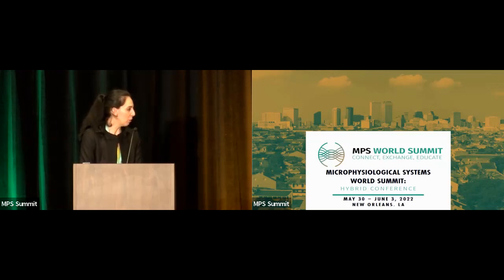And that will create some questions that we need to address in terms of compatibility with the media, and also at which stage we need to connect the chips. The stage of maturation will also play a critical role there. So they can be connected, but we need to address all these challenges in terms of timing and connectivity in terms of medium performance, and enabling the cells the best environment they need. Okay.